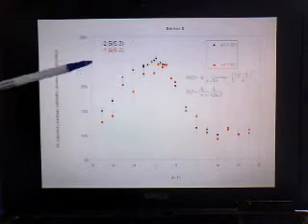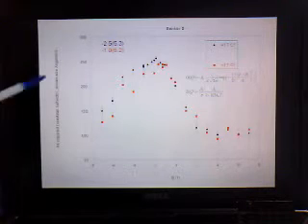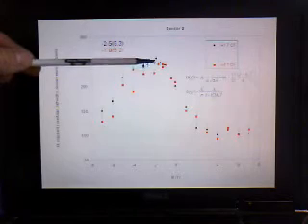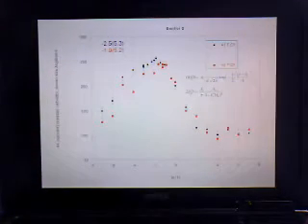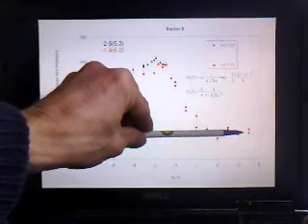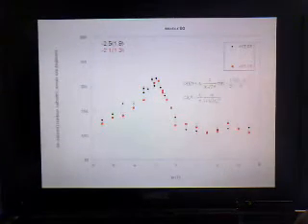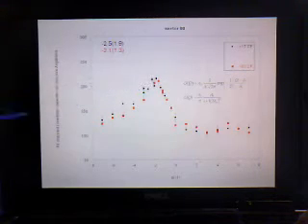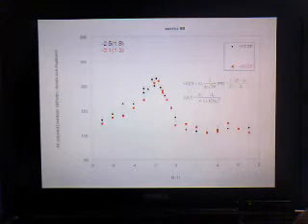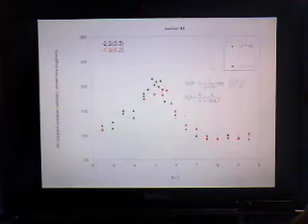And so now we'll look at the half-width. So this is actually the domain size in angstroms here as a function of applied field for sector 0. So you have the largest domains at the exchange bias field and the smallest domains at the higher fields. And I believe this doesn't change very much as we go from sector 0 to sector 45 and sector 90. Okay, but this peak did decrease. So again, at sector 90, there's not too much difference between the two cooling field protocols, whereas at sector 0, there is still a bit of a difference.